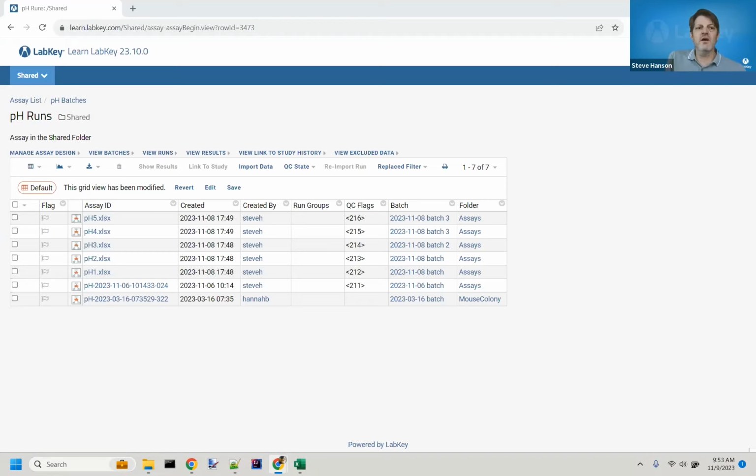Also, similarly with folder and project names, it makes the URLs really ugly to have spaces, because spaces are replaced by something like %20. And so I really like to use underscores when I make folder names, because the URLs become a lot more readable. That's a great question.